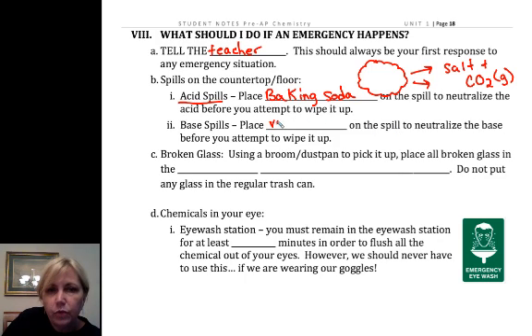For a base spill, we're going to add vinegar, because if we add too much, it's no big deal. So we'll pour vinegar over our base spills.